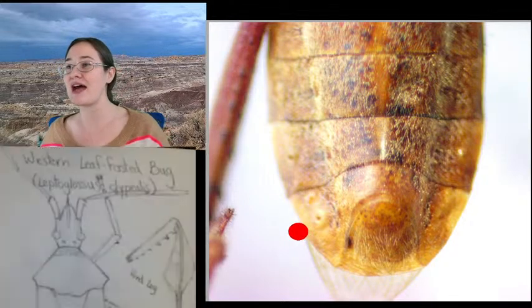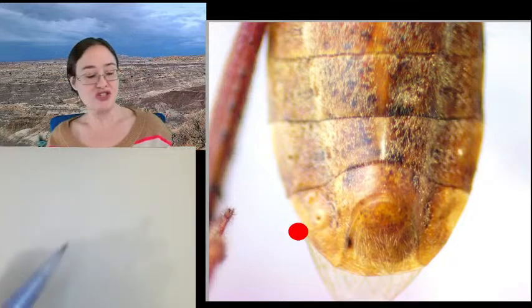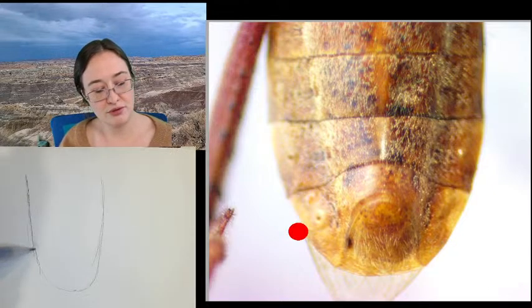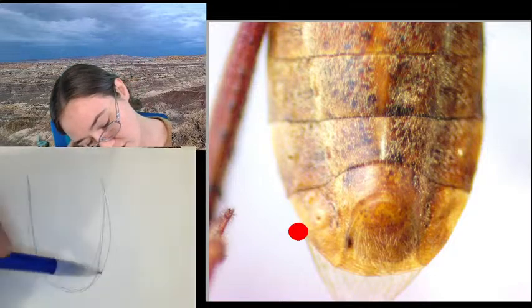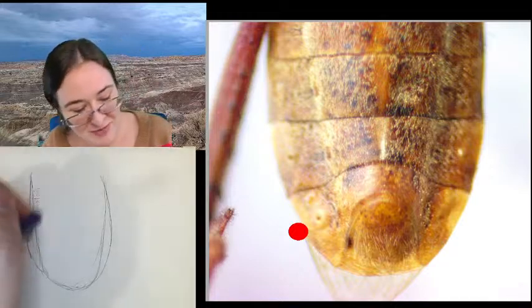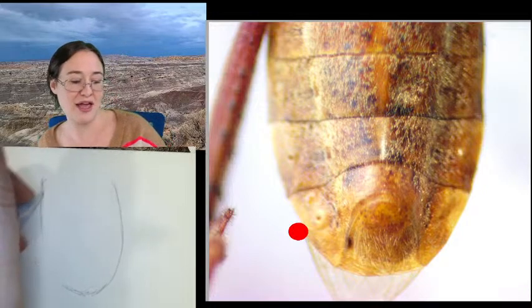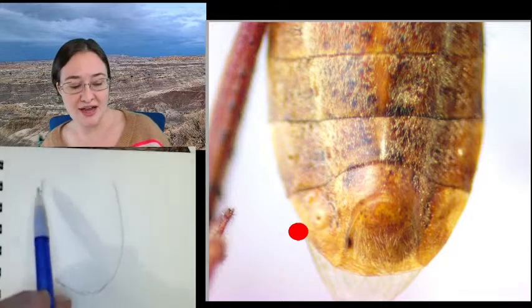And I don't know if we've spent much time talking about spiracles. I want to be sketching, so we're going to sketch while we talk. So I'm going to go ahead and give myself kind of a basic U shape. I want it to be wider. Okay. I want to give myself a shape, and then I can keep talking. So a lot of times when we are checking out these specimens, I like to see things like spiracles, genitalia plates, mouth parts, antenna. Those are the types of things that when you're doing keys, you're going to end up having to look at anyway, right?